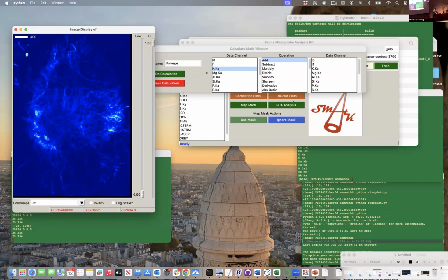So if I took a map of the entire sample, I'm asking about this last thing that you showed here. In the 7.2, the large format beamline, and then I take that sample to maybe 14.3, and then get more fine resolution. Then I can do the same thing, showing, okay, this is my bigger data, which is coarse resolution. But then, okay, here are certain places I want to highlight. Definitely.